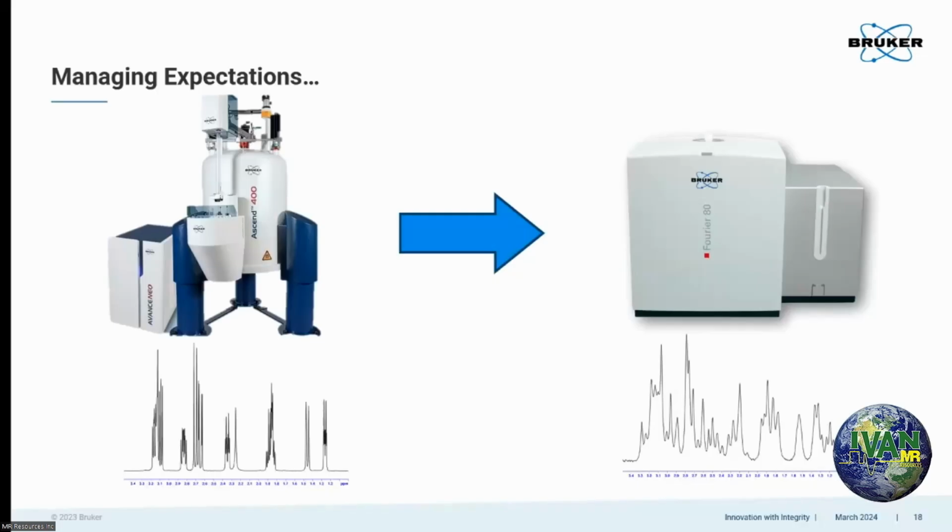So first up, for those of us familiar with using superconducting magnets, here we have a 400 megahertz spectrometer, and this is a sample of brucine. It's got all of the features that we're used to seeing in NMR, nice multiplets and well-resolved peaks. When we take that same exact sample and put it on an 80 megahertz spectrometer or benchtop system, we get this resulting spectrum. So it does look quite different, and it can be pretty off-putting to begin with.